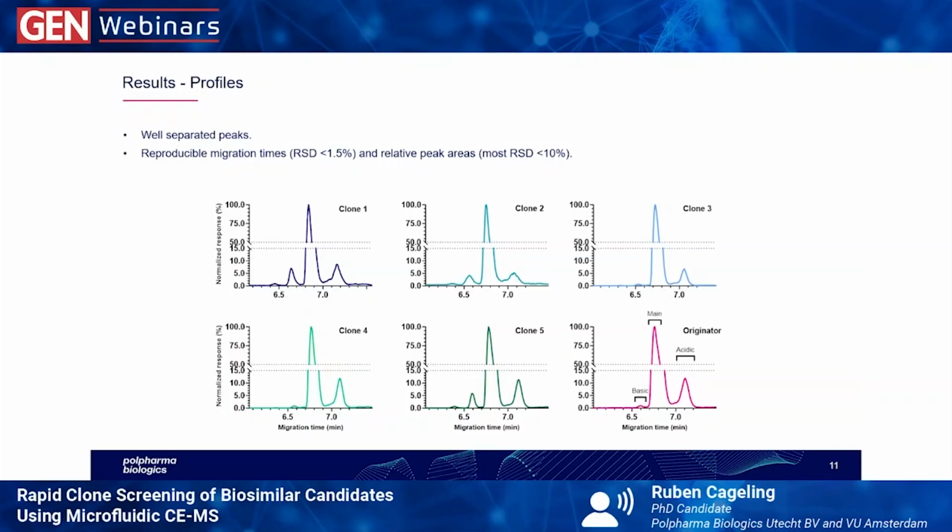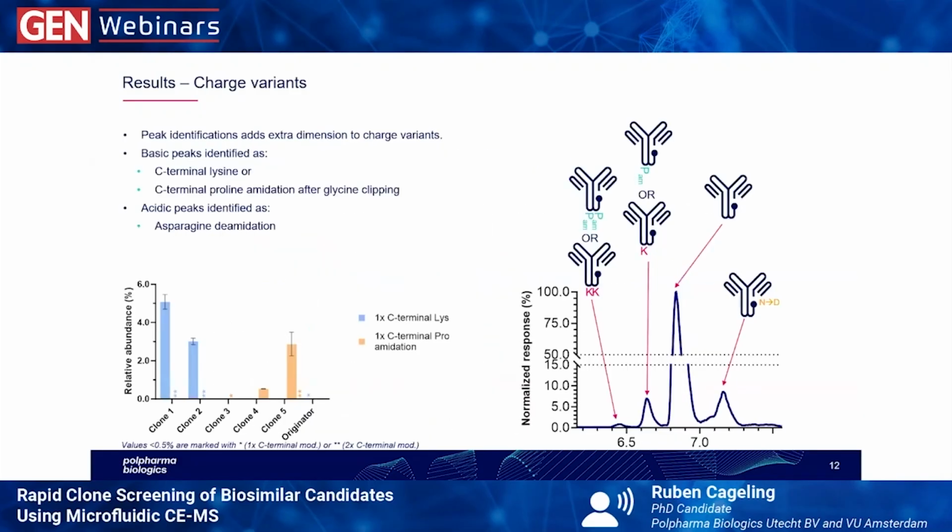If you would do ion exchange with UV detection, you would stop here because you have your percentages acidic and basic. But now we really look into one of the benefits of this method, and that is determining what is behind each peak. What is each charge variant?